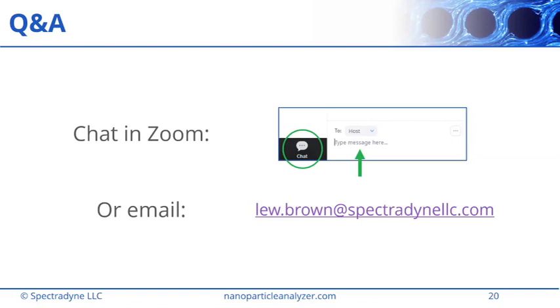Right. Yeah. So some of the methods I've tried: one is ultracentrifugation into a sucrose cushion, and then we followed that up with size exclusion columns to purify. And that's one where we've seen generally the EV yields are not too good. I think it's probably the ultracentrifugation damages a lot of the extracellular vesicles. And then putting them through size exclusion columns will also dilute them to an extent. So it's kind of not the best method. And just ultracentrifugation in general is probably not very good on the EVs.